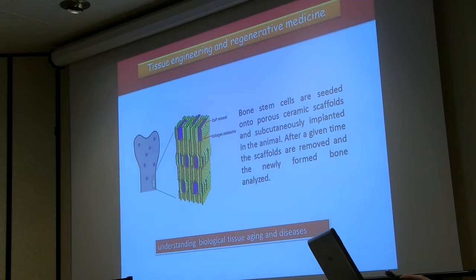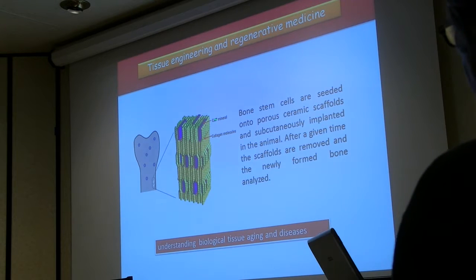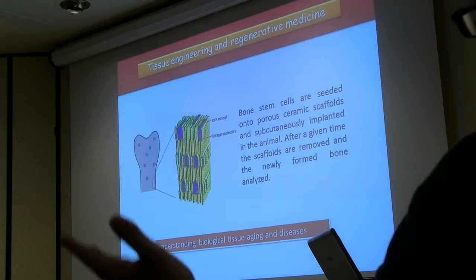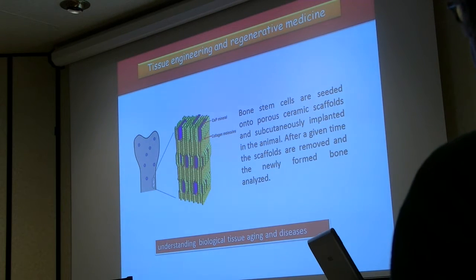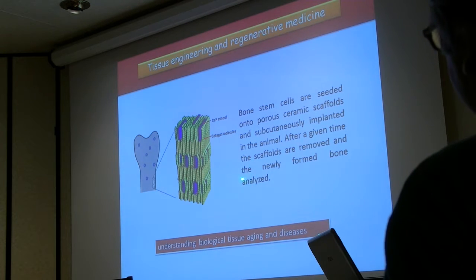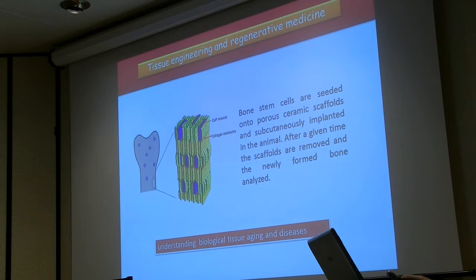Okay, in this example I show a biological study, another subject of study, but in which I use exactly the same methodology, in tissue engineering, where stem cells are seeded on top of a ceramic scaffold and implanted in an animal, and then after determined implantation times, the sample is extracted from the animal and is analyzed.